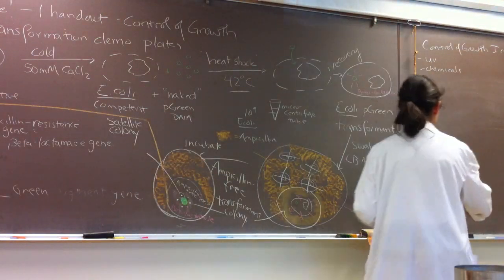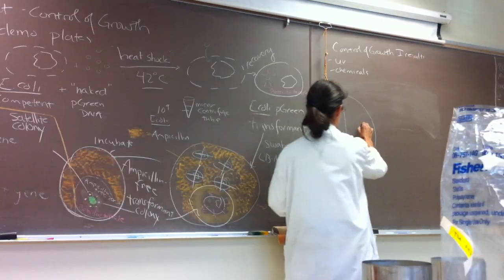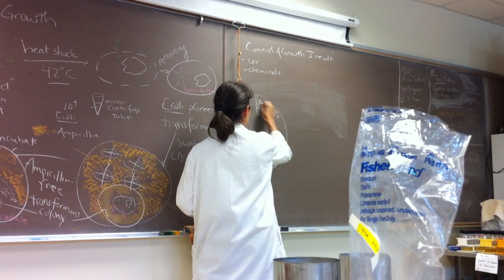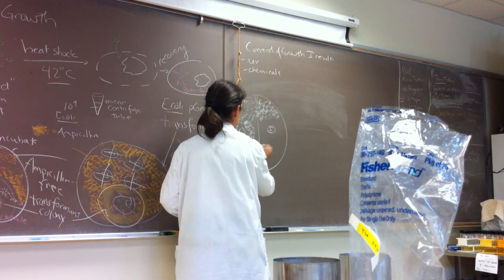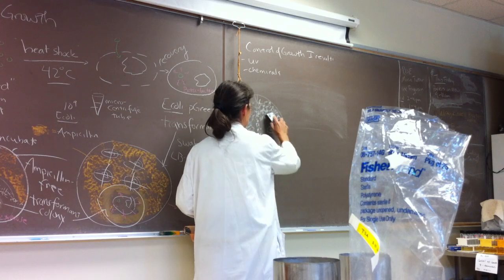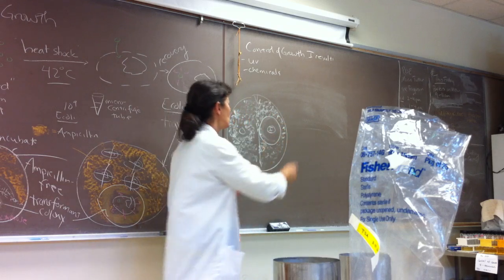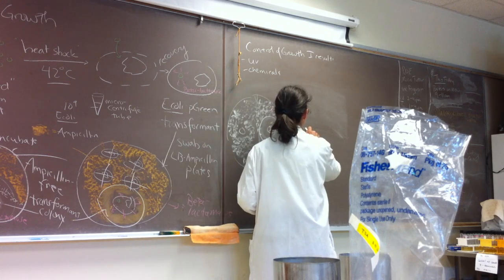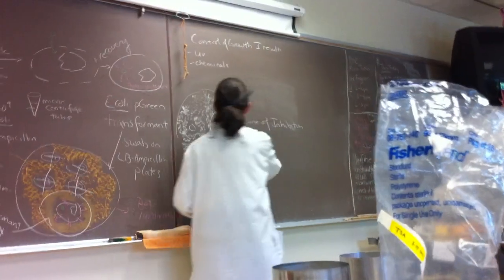And the diameter of the zone of inhibition, let's say that this is one of our plates, and this is the iodine disc. Okay. So you recall that you swabbed your plates to get nice confluent growth. So when you pull your plate, you want to hold it up to the light, and what you're looking for is an area surrounding the disc in which you have no colonies growing. What is that zone called? Zone of inhibition, right?